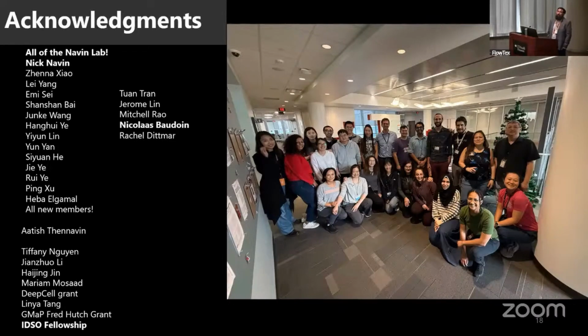Right. I am not doing any traditional markers for that. One of the reasons is, I know this was in cell lines, but we're getting patient data. And so the tumor samples have to be processed very quickly or they'll start to die. And then you get into these caveats of, well, what does the morphology mean? And so that's why we're focusing on this label-free.